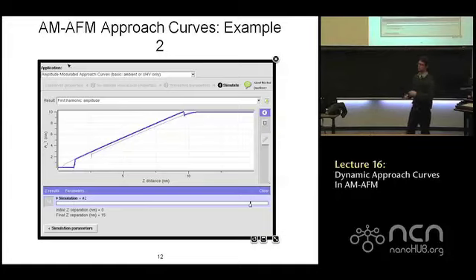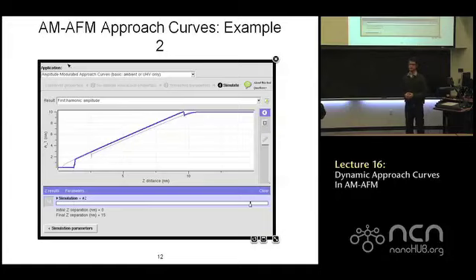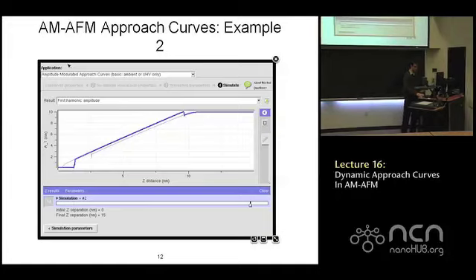So there's a bistable region for the equilibrium of the tip stuck onto the sample and popped off of the sample. But in addition, there's a second bistable regime, and this has to do with attractive and repulsive regimes of oscillation. In one case, we approach the sample, we feel the attractive forces, the van der Waals forces, and they're reducing the amplitude. Then at the same set point on retraction, at the same Z distance, we're actually tapping on the sample, just based on initial conditions. And because this is a nonlinear system, we can't assume too much that it'll behave nicely, basically.